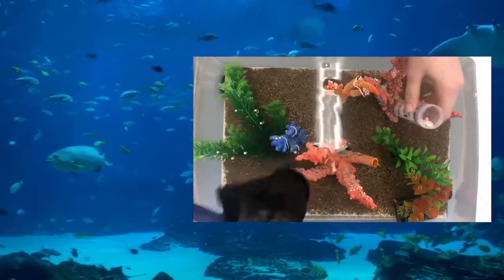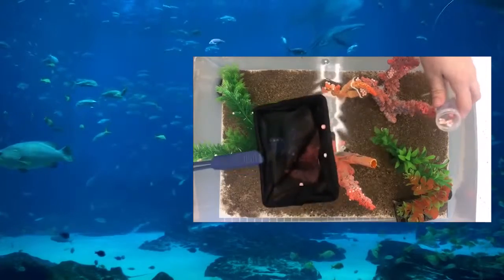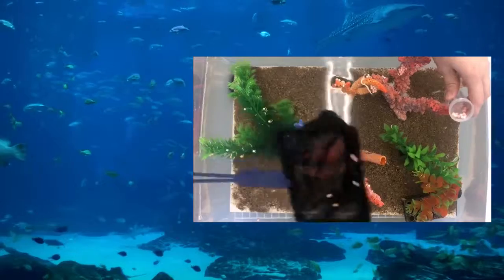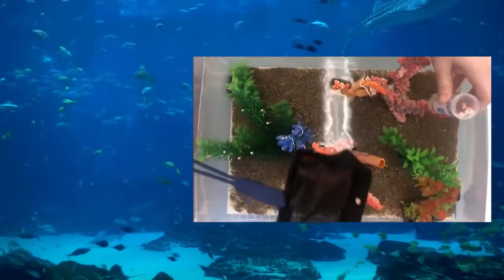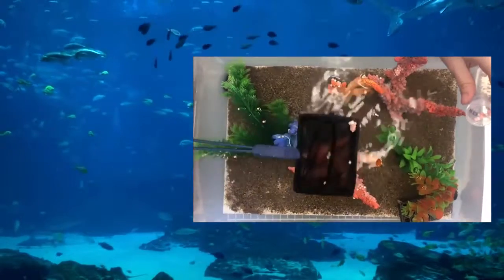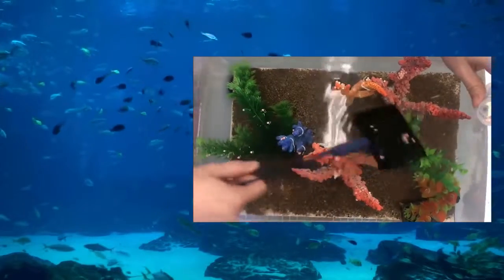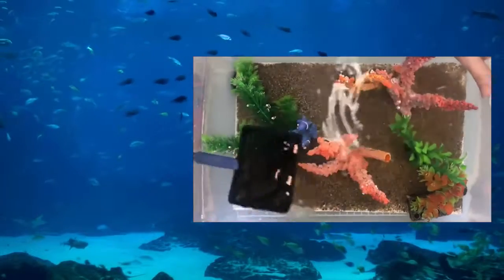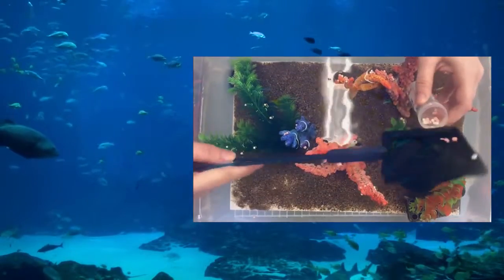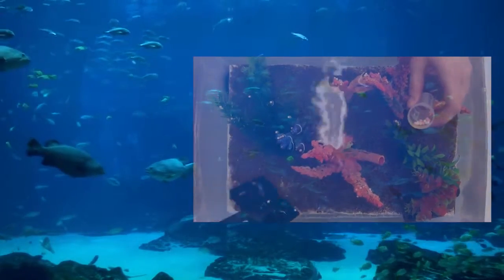So what we are doing here is a simulation of what they actually do out in the wild to grab coral eggs. In here we have the coral eggs. Usually they are this color as well. They're usually a very light pink color, and we're using the net to catch the eggs. Then we will make sure that we're not touching them with our hands, because our hands have an oil that will kill the corals if we do touch them. So we have to put the eggs very carefully from the net into the test tube without touching the coral eggs themselves.